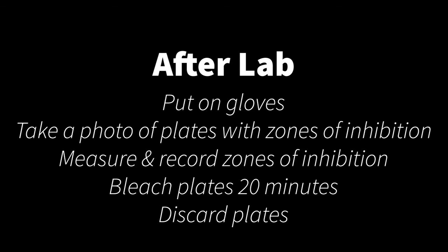So to finish up this lab, you're going to want to put on gloves and take a photo of the plates with these zones of inhibition. And then, of course, measure and record all of these zones of inhibition and put that information into the worksheet. Once you've done that, you're done. And so then you can bleach the plates like you've done in the past and then discard them after the appropriate time. So 20 minutes with bleach, pour that down the drain, and then wrap your plates and then discard.